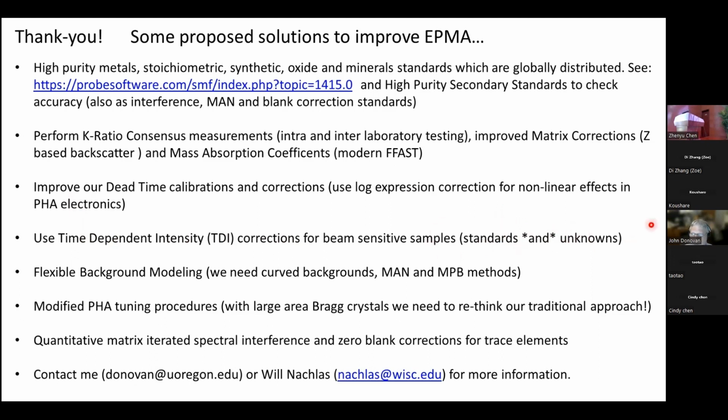And sometimes these TDI effects are also orientation sensitive. It depends on the orientation of the material. For instance, micas have a very different TDI effect depending on how the grain is oriented. We need to have better background models, and we need to think about our PHA tuning.